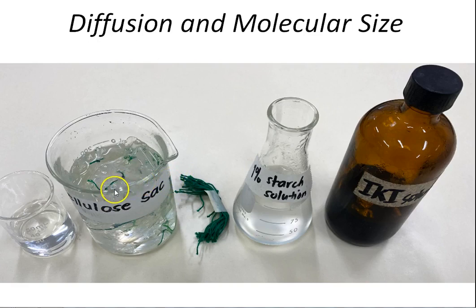The experiment will use starch and iodine solution. As we may have known already in our general biology in high school, the reaction between the two substances, between your starch and iodine, will result in a blue-black discoloration, which will indicate the presence of both in the medium.